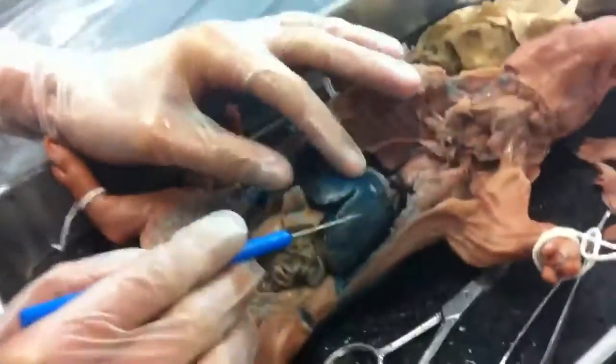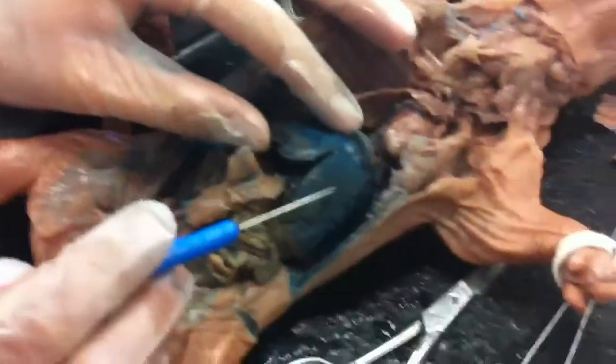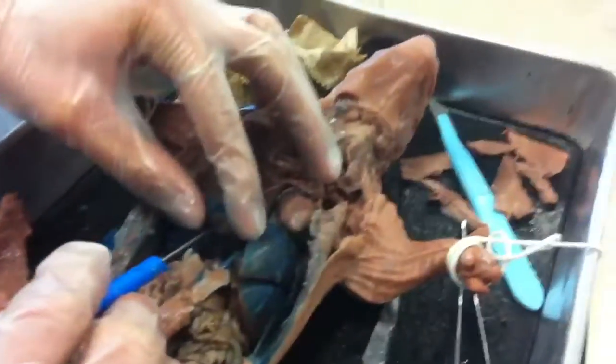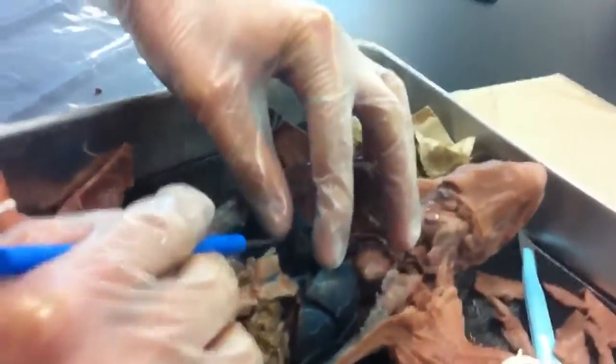Then the liver is right here — big blue thing. Then the gallbladder is right there, underneath the left side. The stomach is this.